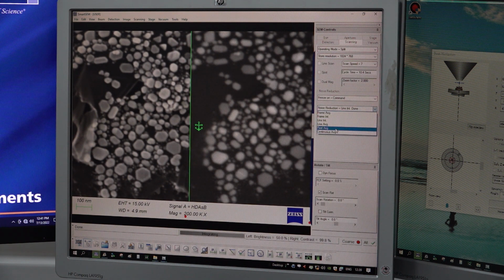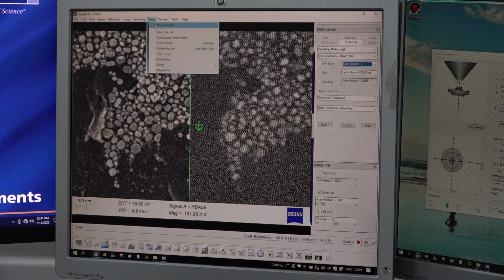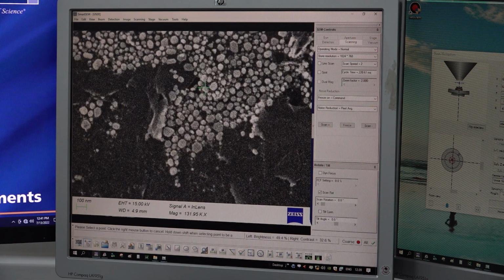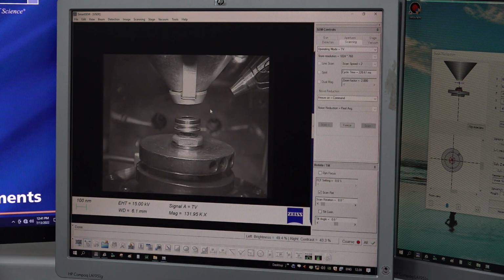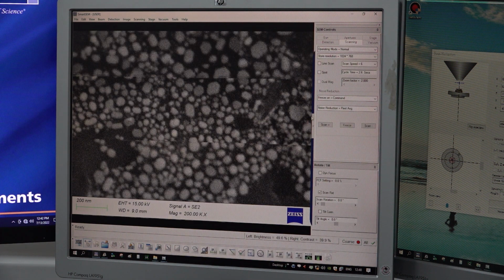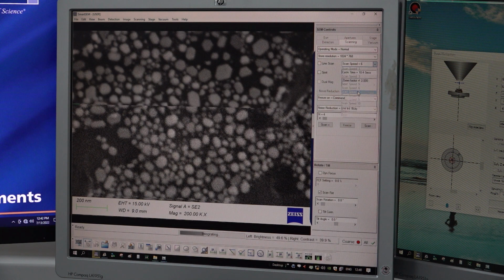So we have already covered two of the dominant class of signals. Now we are going to see secondary electron image but using ET detector. So I have to increase the working distance. You can see now I will go somewhere around 8.5 at 2 lakh magnification in secondary electron mode, using the ET detector.